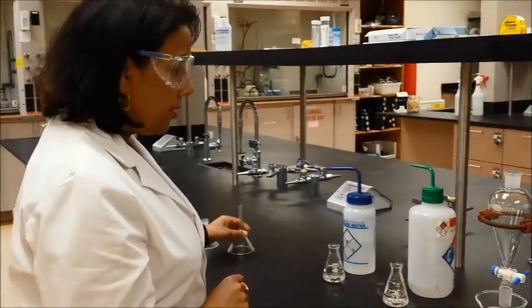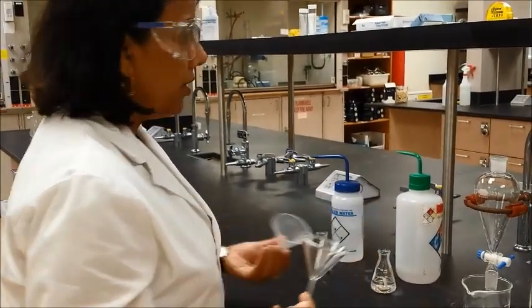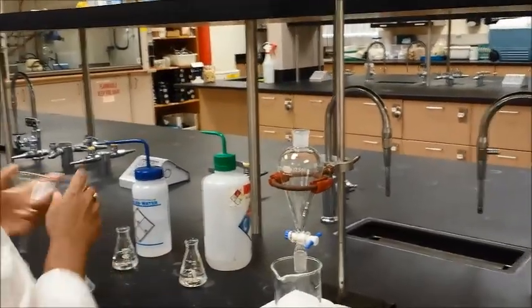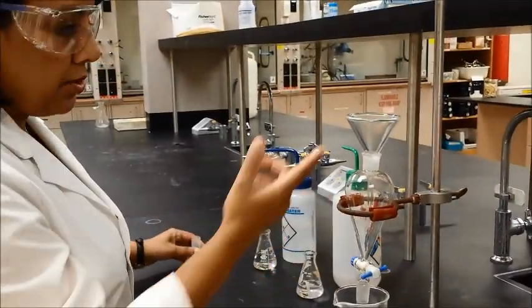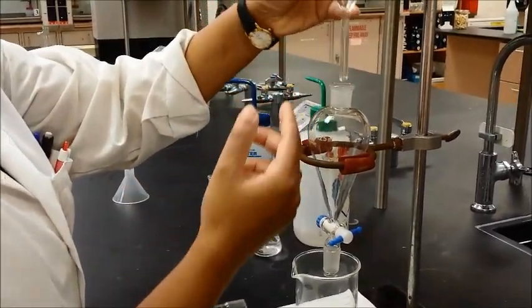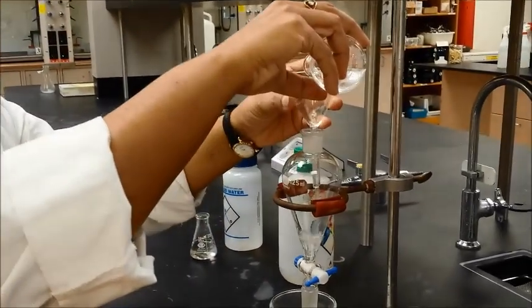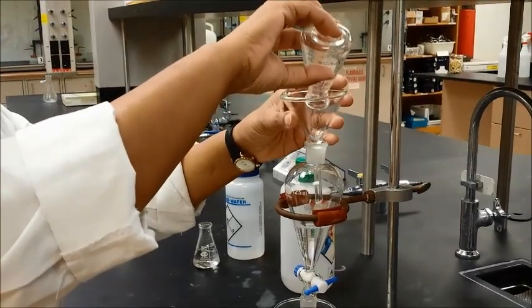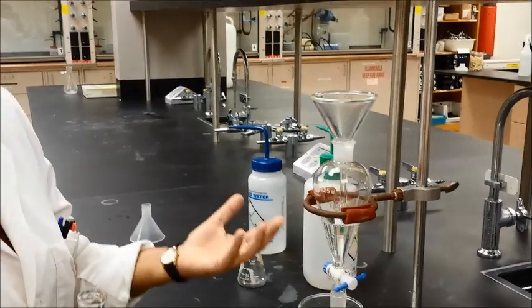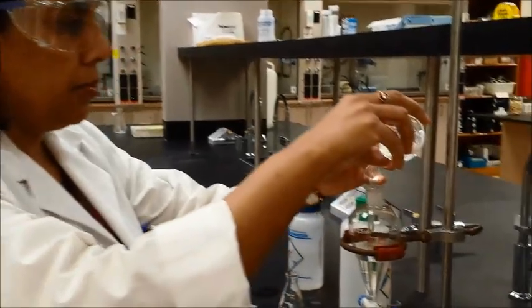When you're ready to pour your solutions into the separatory funnel, you will need a funnel. You can use a regular funnel or a powder funnel, whichever one fits. Use the regular funnel because it has a thin stem — just make sure you don't get too long of a stem, otherwise the organic solvent will start evaporating. So whatever you need to extract, go ahead and pour that in, and then pour in whatever you're extracting with — for example, sodium bicarbonate solution or just water — then pour the second layer in.